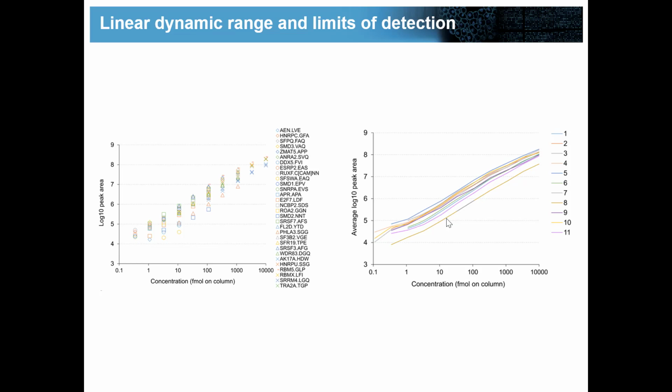So while you can do SILAC and it does benefit you in terms of the quantification potentially, it can be a hindrance in terms of selectivity and being able to selectively quantify the peptides you want. So this is a long way of saying that most of the quantification we do in our lab is done in label-free mode.